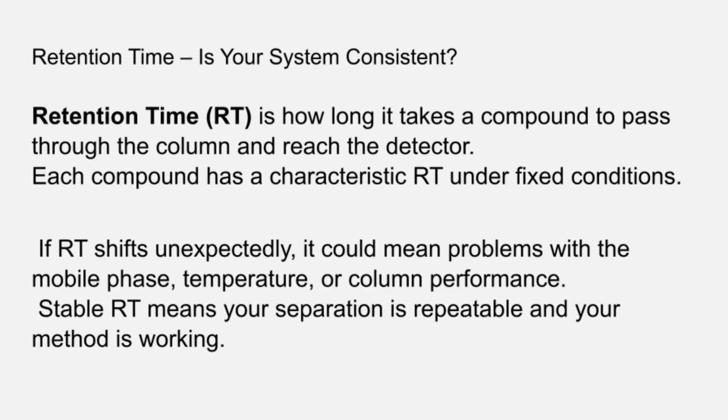Retention time is how long it takes for a compound to pass through the column and reach the detector. Each compound has its own retention time under fixed conditions. If retention time shifts unexpectedly, it could mean a problem with our mobile phase, temperature, or column performance. A stable retention time means your separation is repeatable and the method is working.